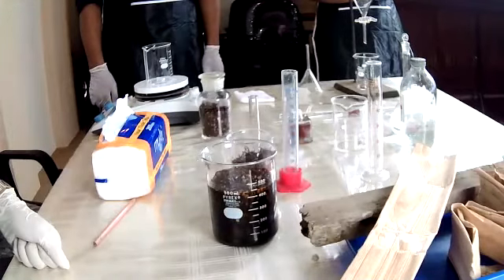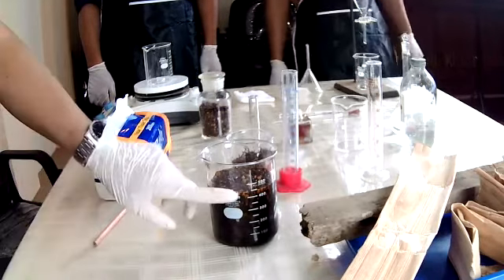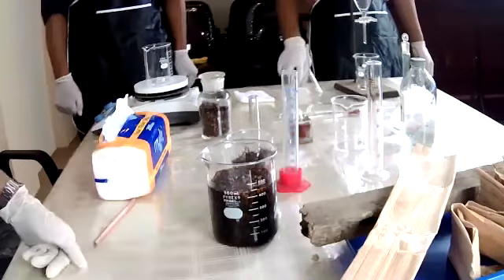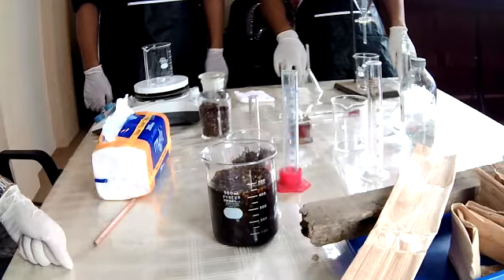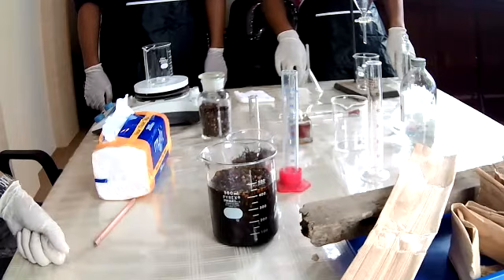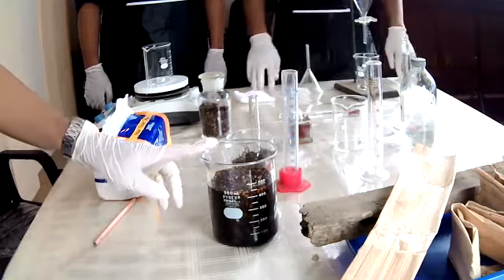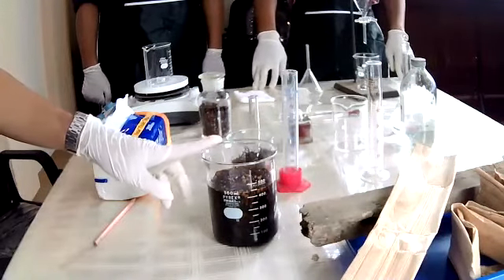So the solution is 5% tobacco and 5% clove. And this is 400 milliliter. We use 20 grams of tobacco and 20 grams of clove. So this is exactly what the people traditionally in Kudus use these ingredients.